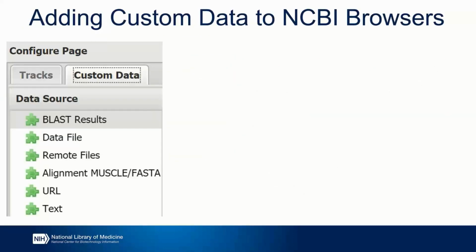So now you have an idea of which kind of tools we actually offer to view your genomic data, but even after you've picked the right tool, you still might be a little bit confused about what kind of data you actually can visualize. So let's talk about that for a minute.